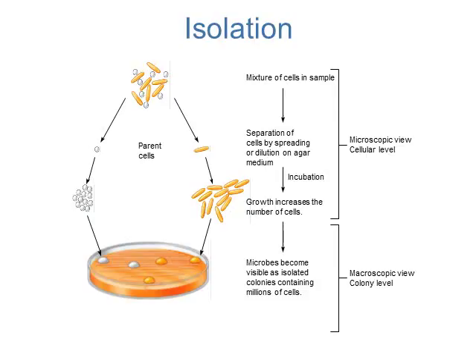So on our plate we have white colonies and yellow colonies. And you can tell colonies apart. They're going to have different colors, different sizes, different shapes, different textures. And we'll look at the macroscopic part of colonies in one of our labs. So because these two colonies look different from each other, we can assume that they're different species of bacteria.